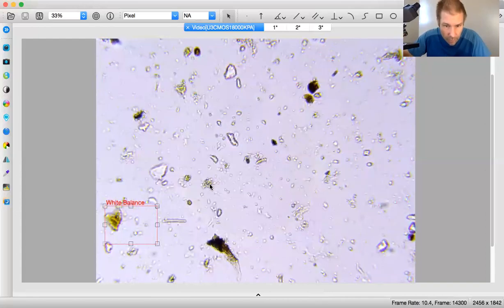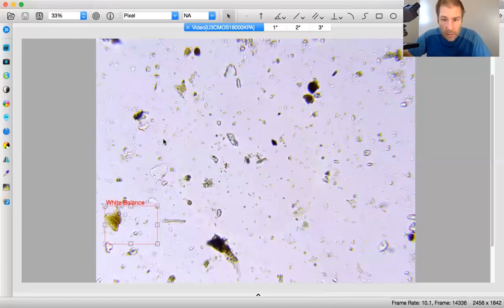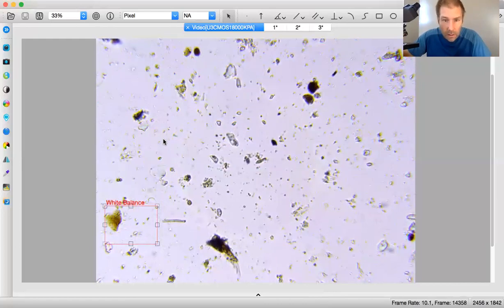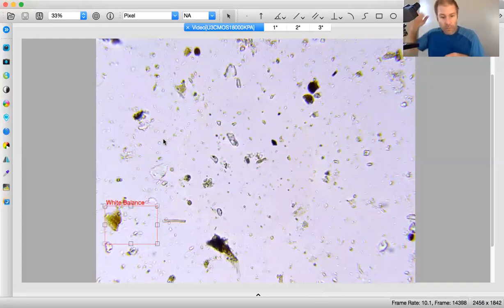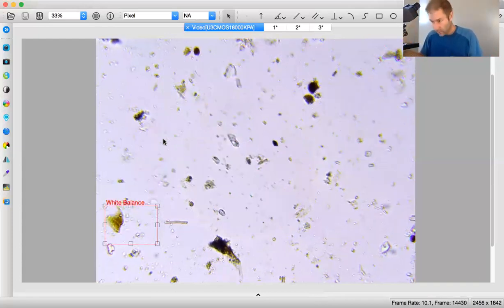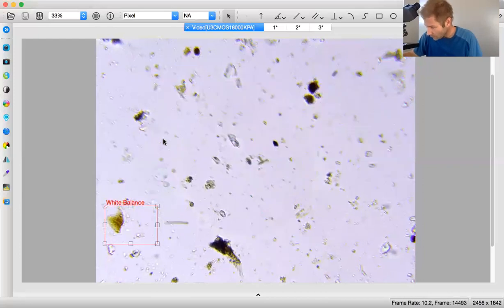So 0.15 now. And I do not see anything else. So 0.15 actino in addition. Okay.